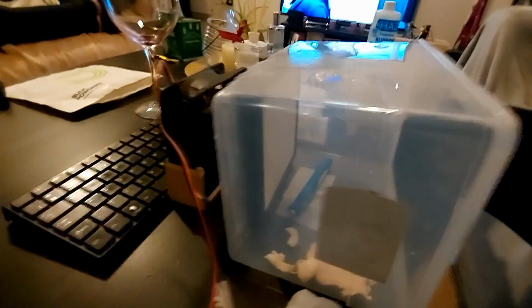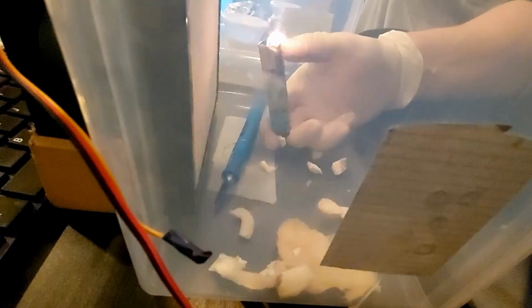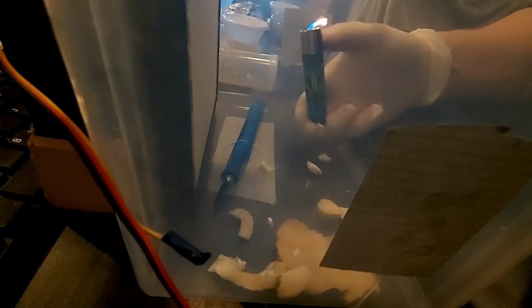This is what the setup looks like when it's all put together. It's pretty portable, so I can use it at my computer desk. Here I am just sat in the living room using it. And here you can see that there's sufficient airflow inside the box. I read online that it wasn't possible to do this, but the parts were so cheap I thought I'll just give it a go and see if I get anywhere. And it turned out that it worked quite well.